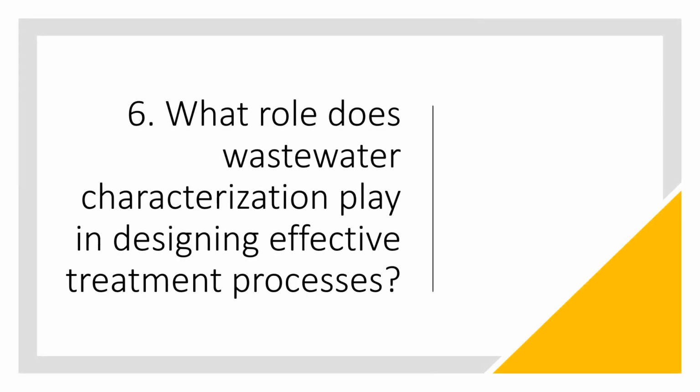What role does wastewater characterization play in designing effective treatment processes? We all know that characterization is a primary thing which is required prior to designing any treatment chain or treatment processes. So wastewater characterization helps us to determine what is the appropriate treatment method, and what are the technologies which are required for removing any specific contaminant or pollutant that is present.